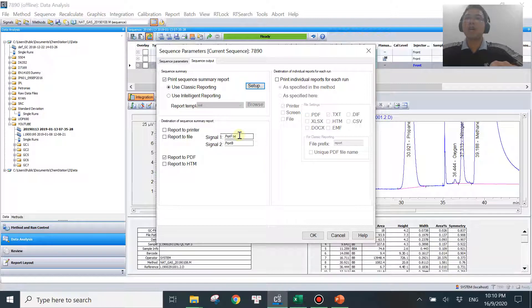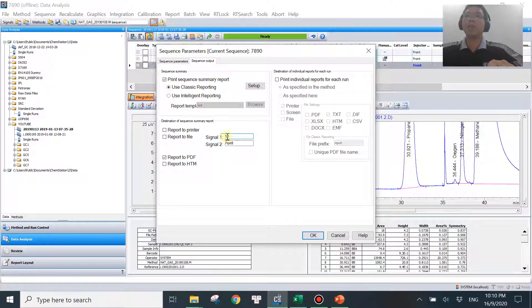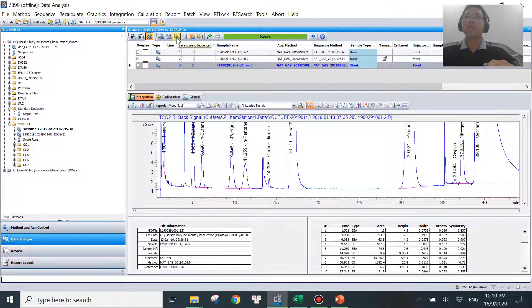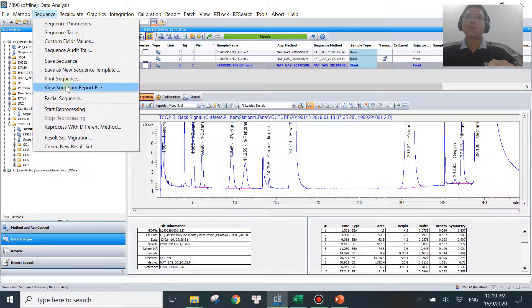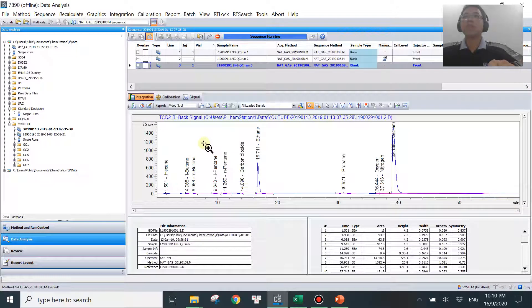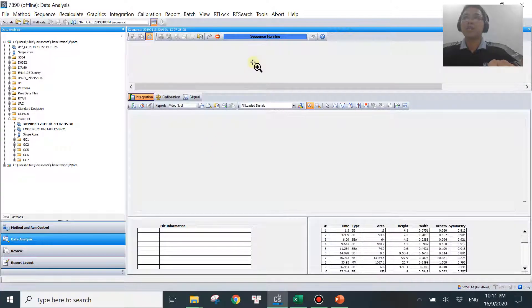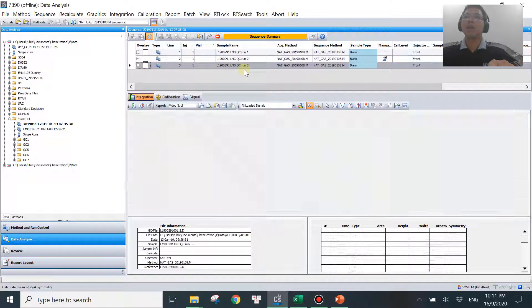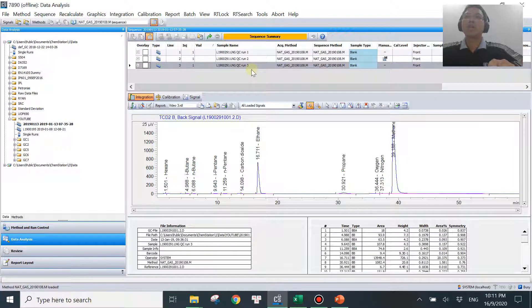Down here you can define whether you want the report as a file or a PDF. Take the PDF option and name it whatever you want — I'll put 'my SD'. Say OK, then save your sequence first before proceeding to generate the report. Hit this button, then go to Sequence and Start Processing, or hit the little green arrow button. The software will now go through each run one by one — processing the first, second, third — then perform the sequence summary which calculates the standard deviation.